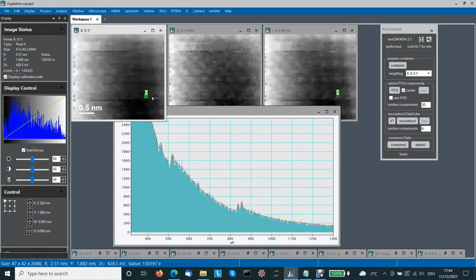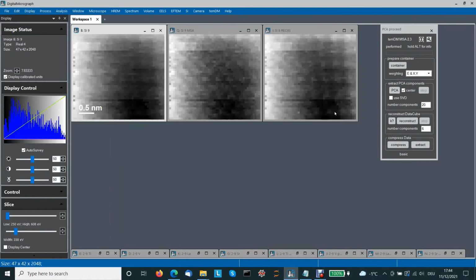Okay, how to stop this twin spectrum picker? Just close the spectrum window without saving, with keeping Alt pressed. Press here. Okay, good. So maybe now we compare how good was our work.